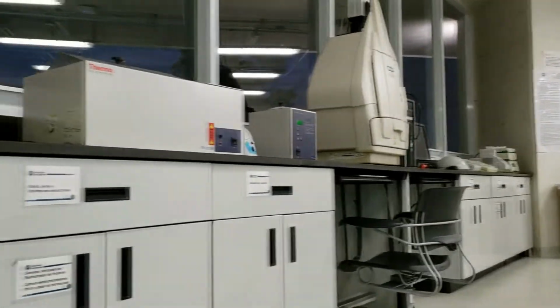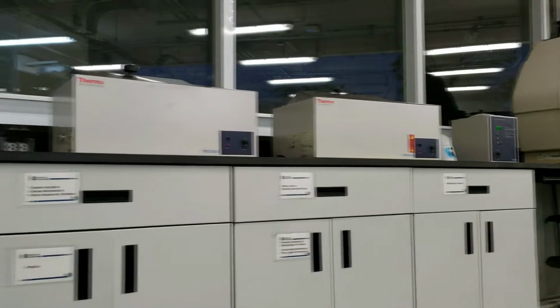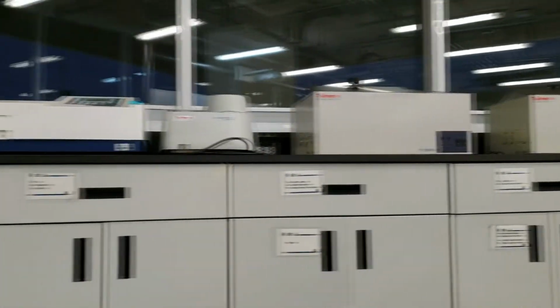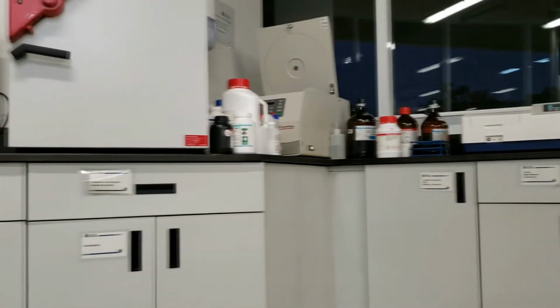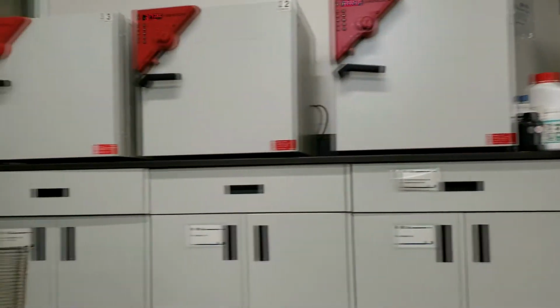From the results reported in tables, statistical data was obtained and then plotted. These results showed a low accuracy, far from the actual value by up to 25%, and high standard deviations, up to 15, possibly due to bad pipetting techniques. Knowing the material and laboratory equipment is a very important factor when you want to carry out a practice, since it optimizes the procedure, avoids accidents, and therefore favors the care of the material and equipment.